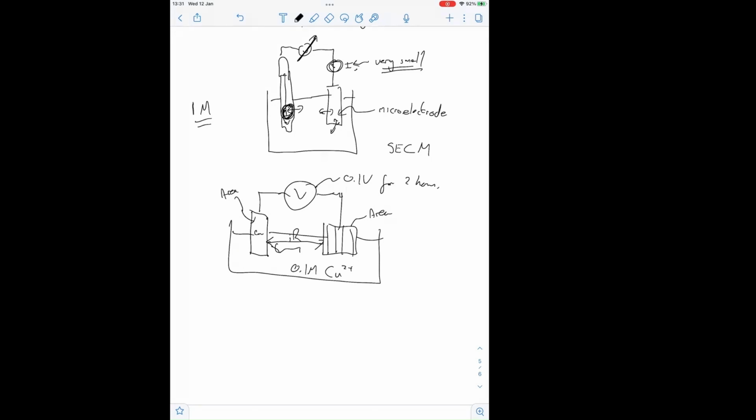So there's a resistance of solution. That resistance will depend on how far the electrodes are apart. So to accurately reproduce a two electrode mode electroplating, I need all the dimensions of the plating bath, dimensions of the electrodes, the distance the electrodes are apart, whether both sides of the electrodes are exposed. Otherwise, I can't exactly reproduce that experiment reported in the literature. It's very common now when people are electroplating just to say what voltage was applied. That's not telling you anything, and it's not useful.